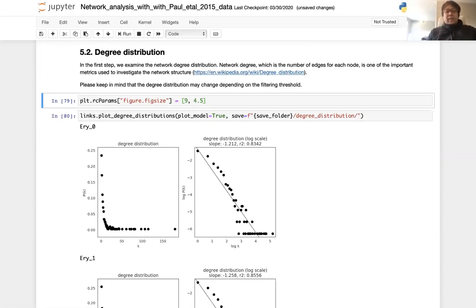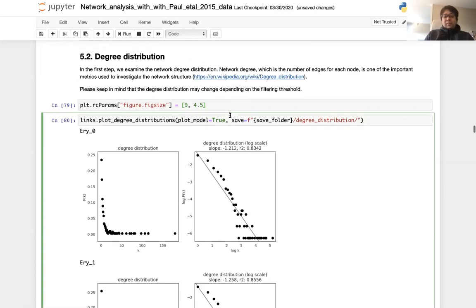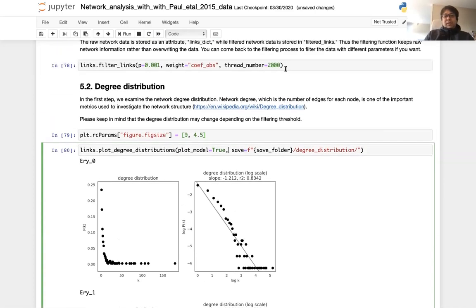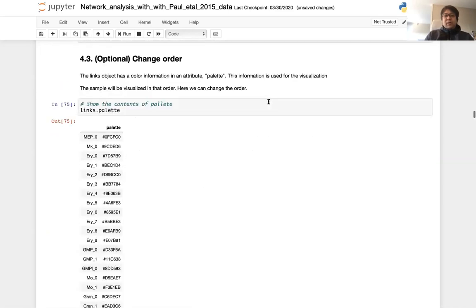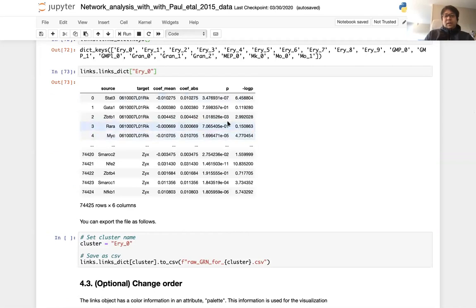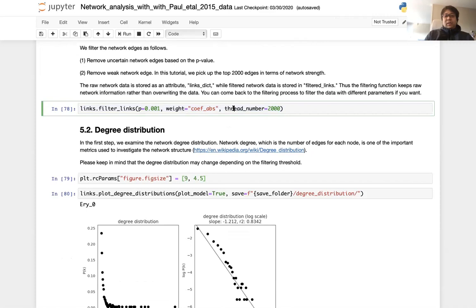The second possibility is that your network inference is bad, or like you said, maybe your data set is poor quality. But maybe you can change this. You can look at your network here, or you can change the network threshold value here.